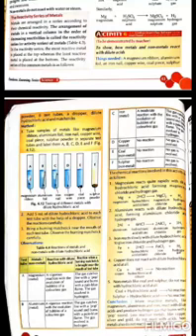And when burning matchstick is brought near the mouth of test tube A, the gas catches fire with a pop sound and burns with a pale blue flame. This observation confirms the release of hydrogen gas during the reaction of magnesium metal with hydrochloric acid.